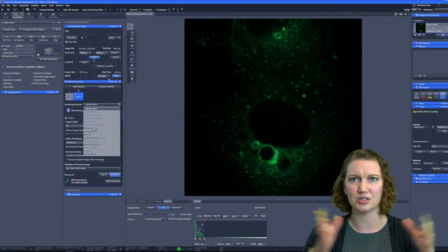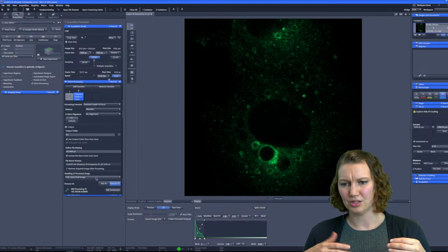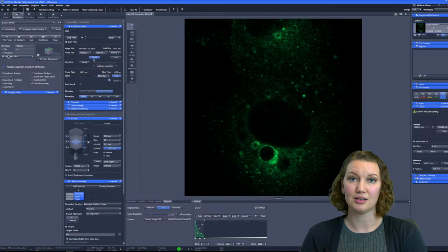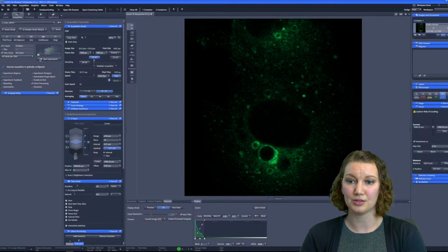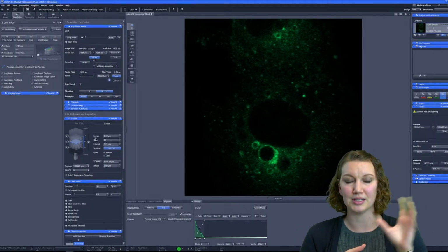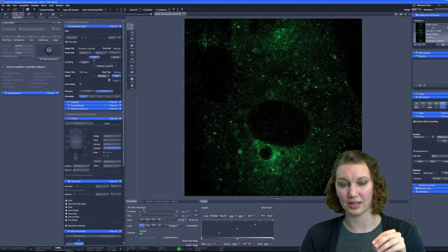And I set this up just to go as fast as possible, so this is a very fast acquisition. We're just going to do 10 time points. This one I just set up on the remote PC. You can see what that looks like in the direct processing selection. But from there, all you really have to do is start your experiment, and this is really wonderful, like I said, when you're doing an overnight time lapse, it will basically be ready for you when it's done, because it starts each time point as soon as it's done collecting.